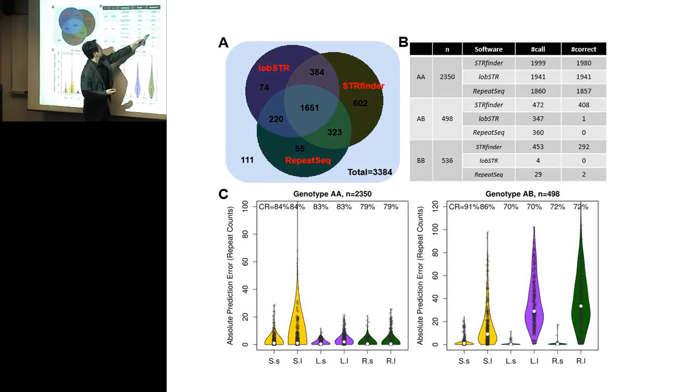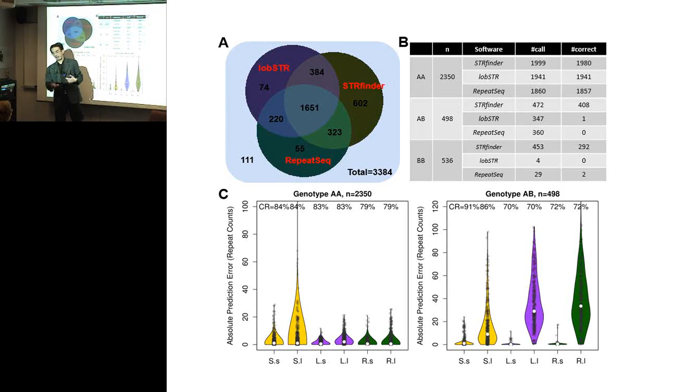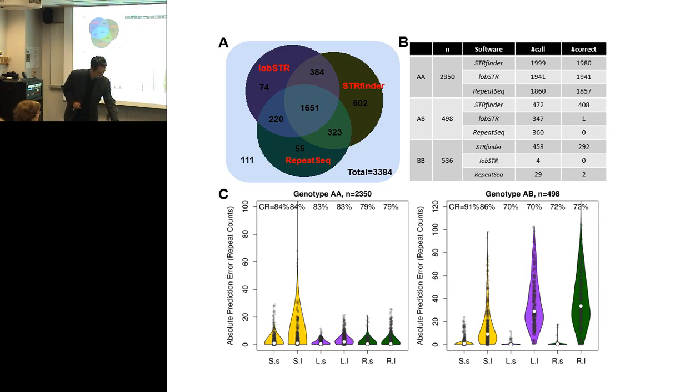And I don't mind putting that out. It's really because they're not designed to call longer alleles. Therefore, they fail completely. So it's not embarrassment on their side. It's really demonstrating that we are doing what we're supposed to be doing. And then there are other reports about how ours performed for short-short and short-intermediate, long-intermediate, and so on and so forth. So that's one demonstration of how it's working well.